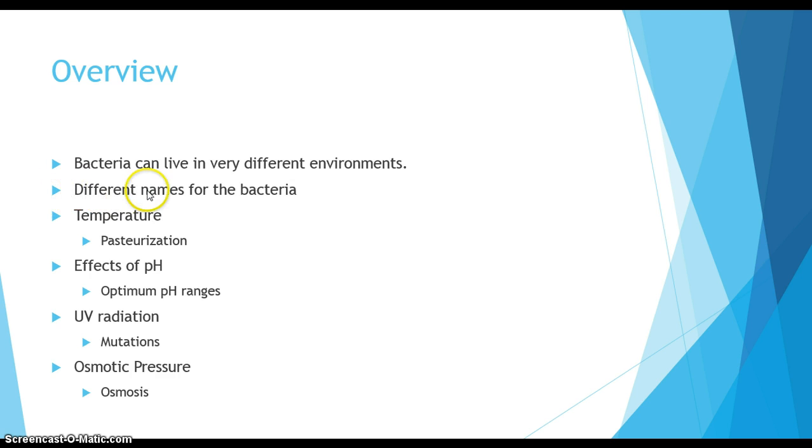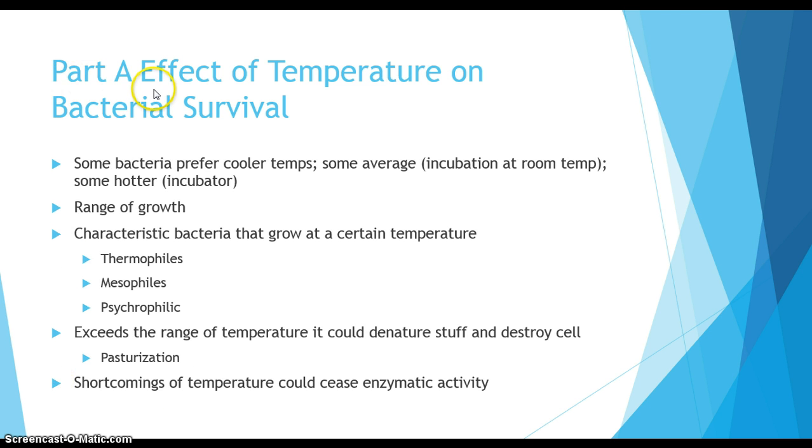What this tells us is that there are different ways that you classify bacteria based off of the effects of these certain conditions on the bacteria. We're going to be looking at that and the major trends that go along with these different conditions. So part A looks at the effects of temperature on bacterial survival.